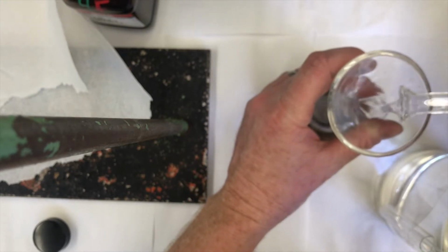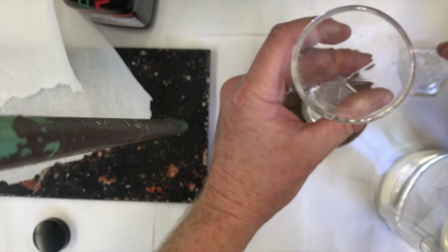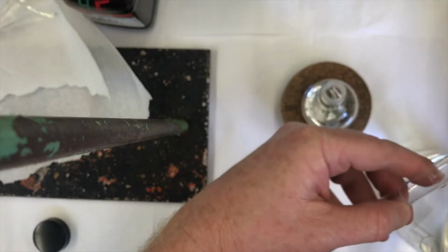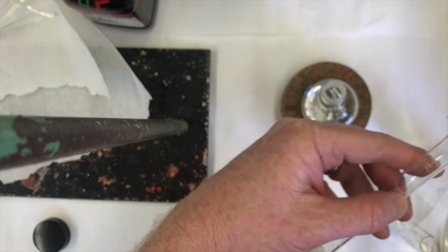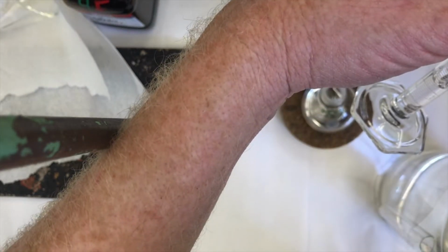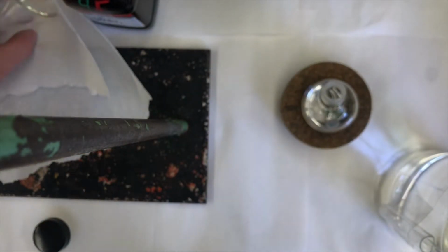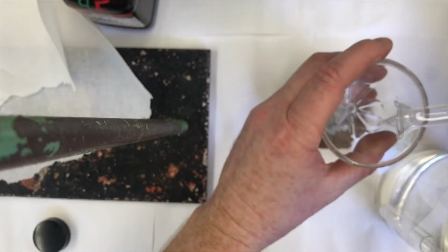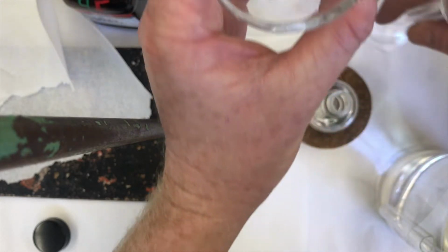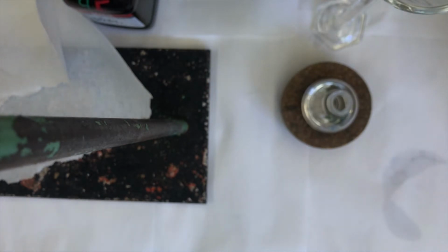Okay, so I'm going to add that 10 milliliters of ethyl acetate first, and then I'll add another 3 milliliters. I'll just pipette this over since it's only 3 milliliters. Already over 1 milliliter, almost to 3. Okay, that's approximately 3 milliliters of ethyl acetate. There we go. Alright, I've got my ethyl acetate. Next up, bromobenzene. I'll do 13 milliliters of that, so I'll have an equal amount of both.